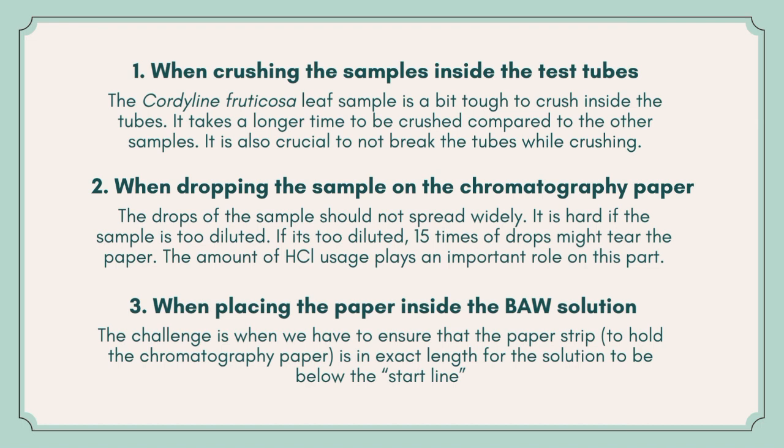The last one is when placing the paper inside the BAW solution. The challenge is when we have to ensure that the paper strip that holds the chromatography paper is the exact length for the solution to be below the start line.